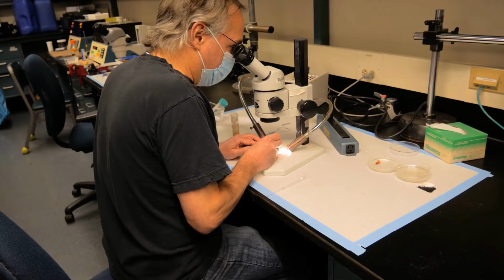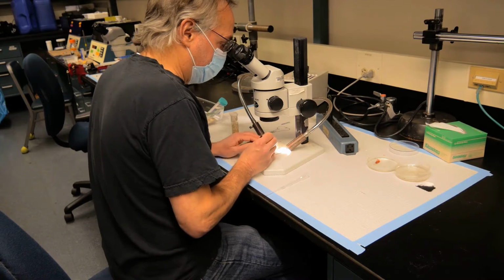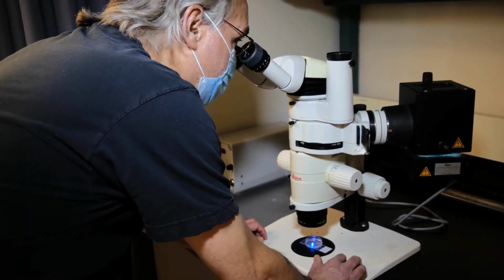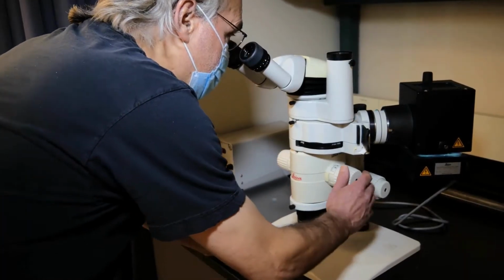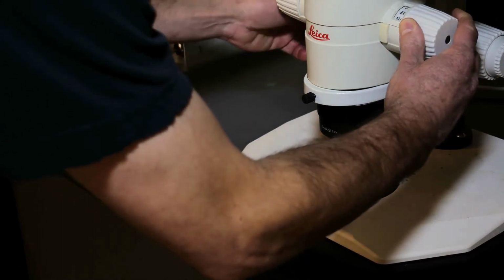Calcium imaging is a technique which is rarely taught to undergraduates because the equipment is just way too expensive. The future of neuroscience is doing imaging research on neurons, and one of the key stumbling blocks is the price of fluorescence microscopes, usually tens of thousands of dollars. Even at a school like Cornell, there are no lab courses for students that incorporate the kind of imaging that we're doing with our scope.